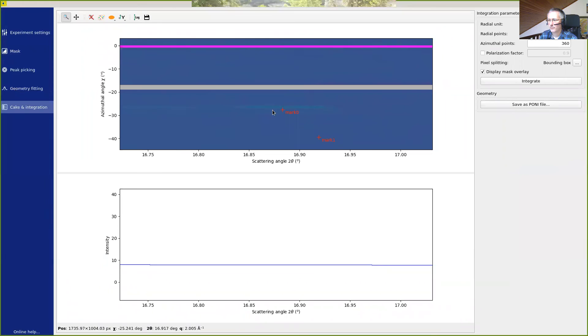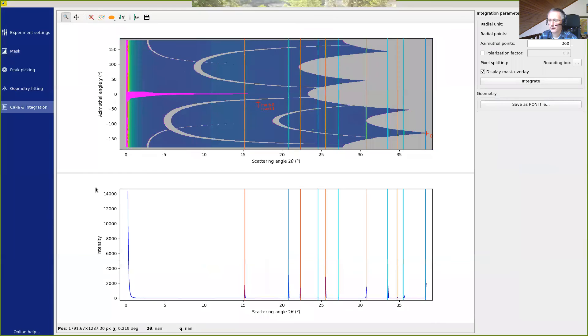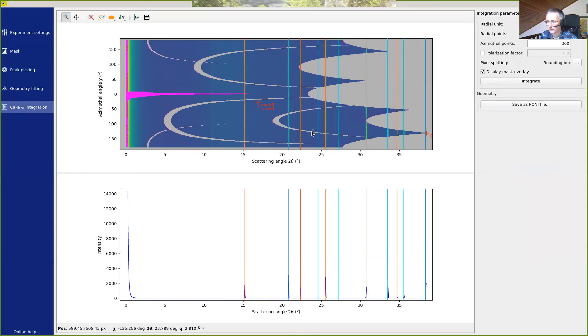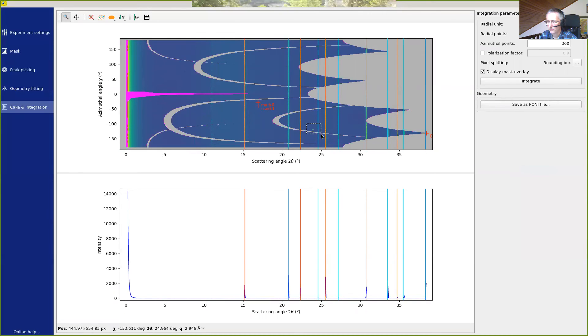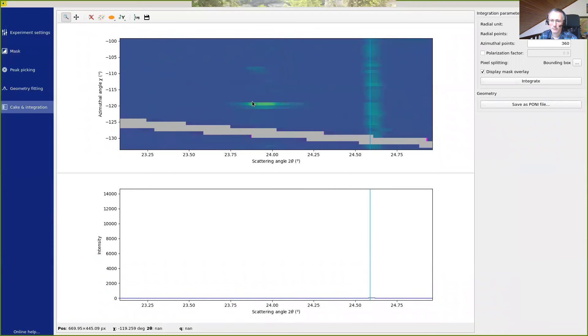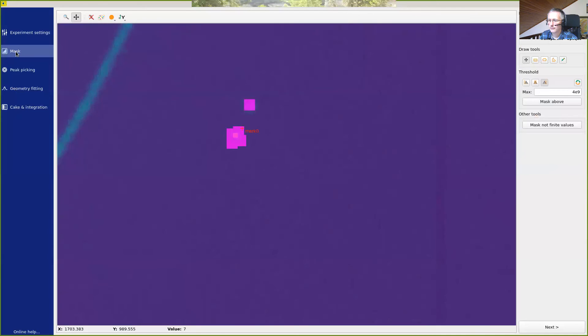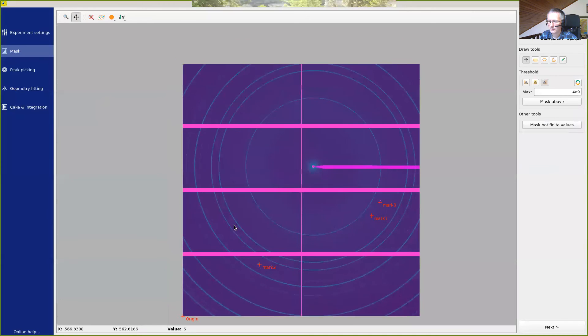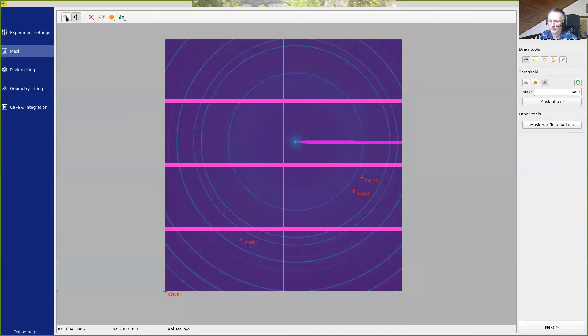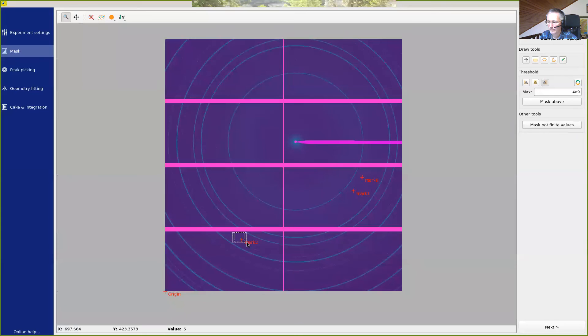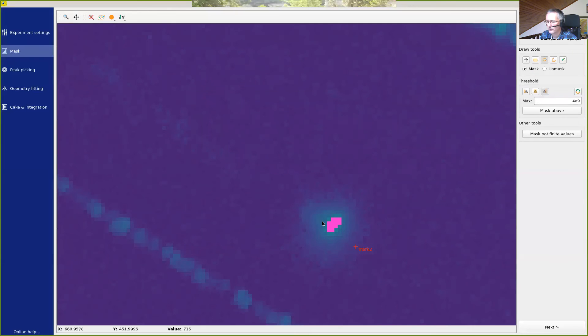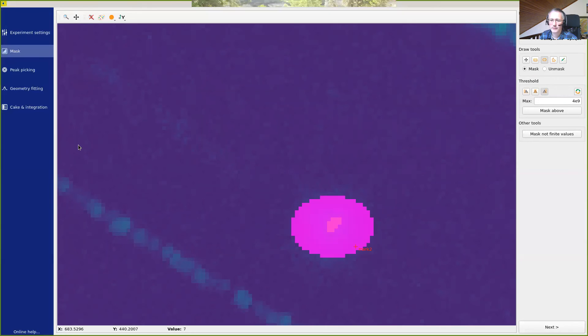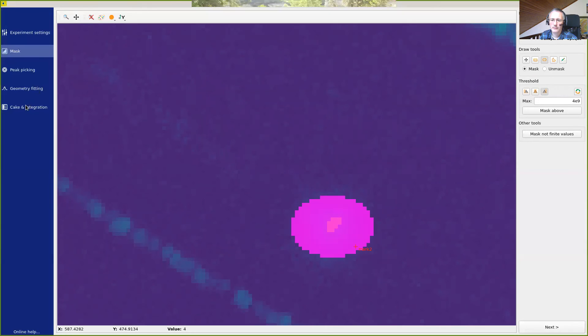And now the diffraction spectrum is much flatter and much cleaner. So we have also a region here that we can again mark. So we can mask this. And now it has disappeared.